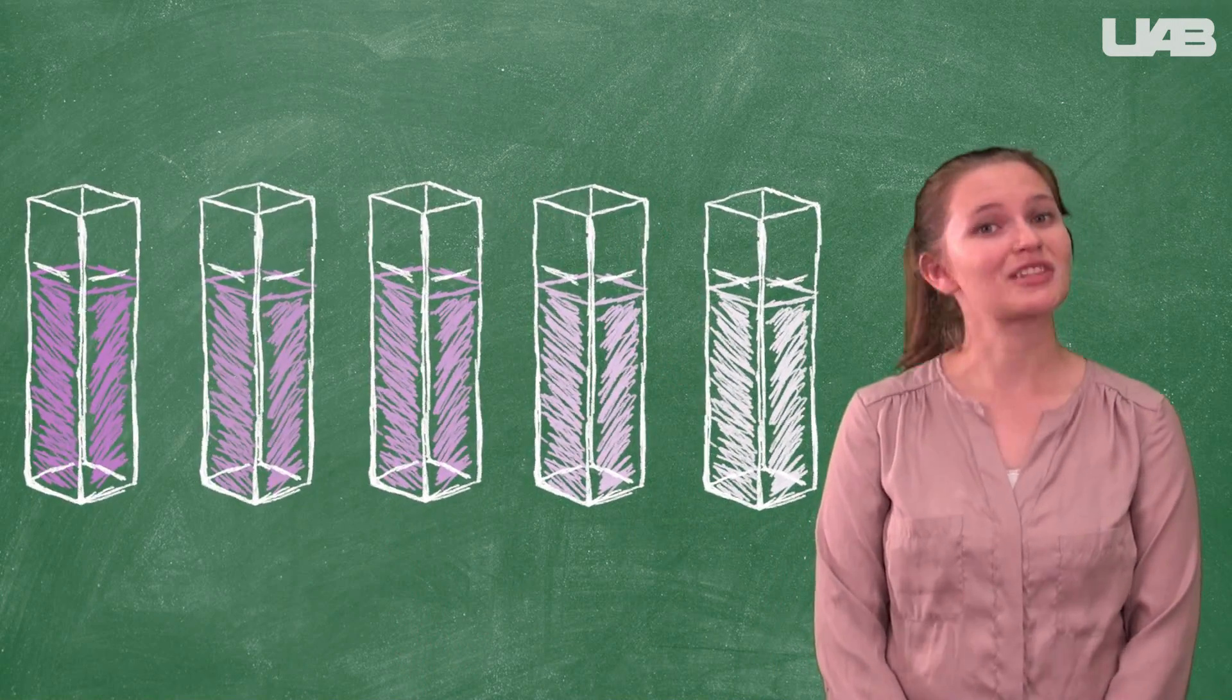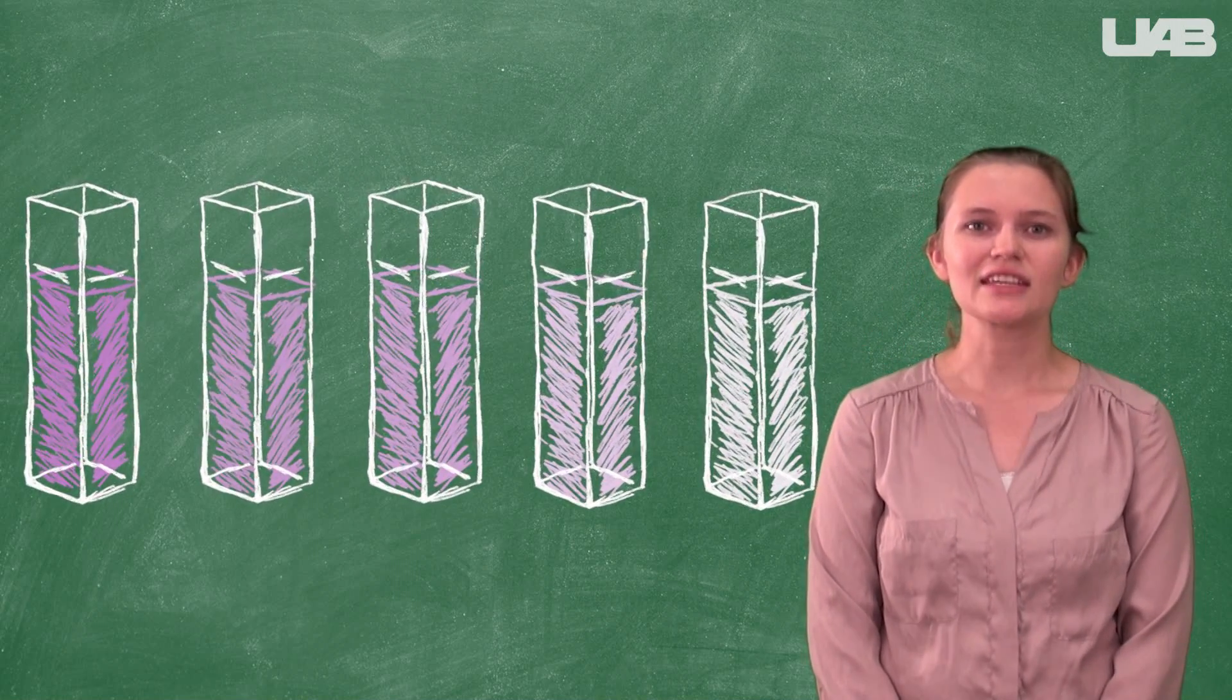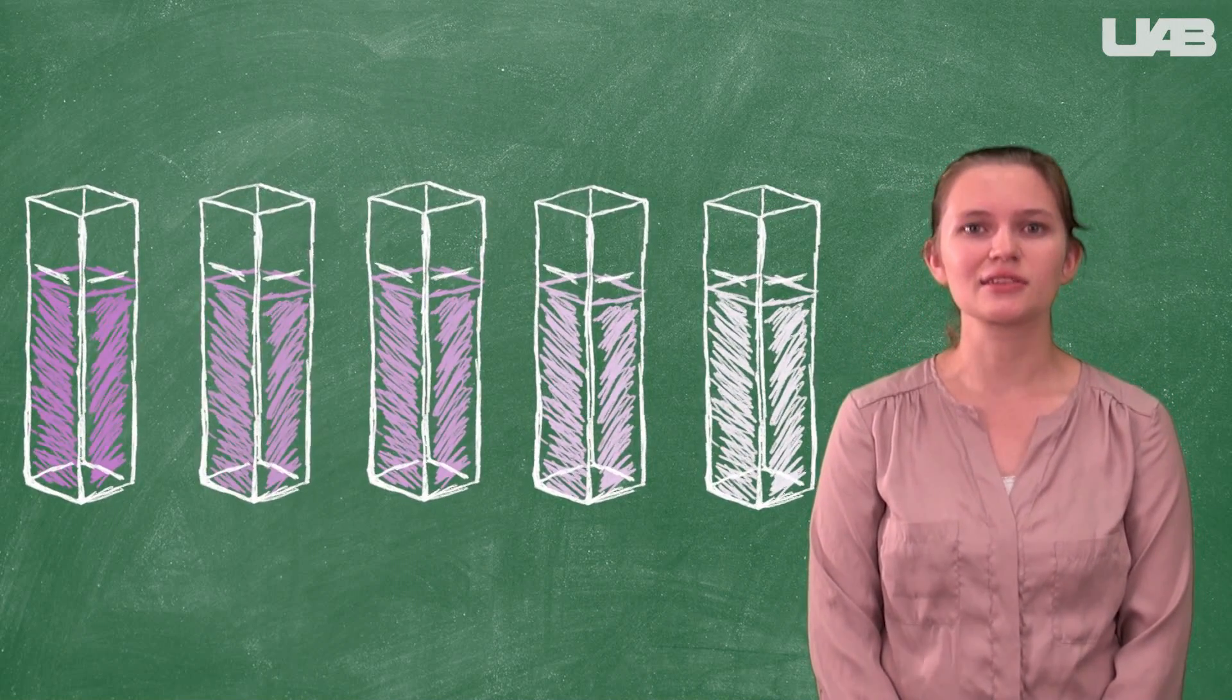You should now have your stock and four dilutions. You will then get five cuvettes. Make sure they're clean. Then fill each of them up about three quarters of the way with each of the solutions.